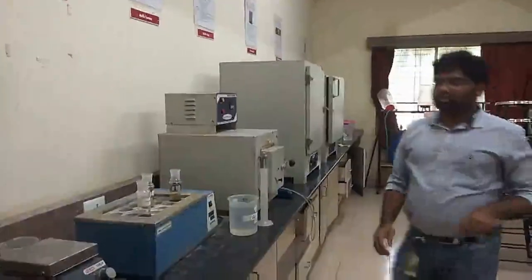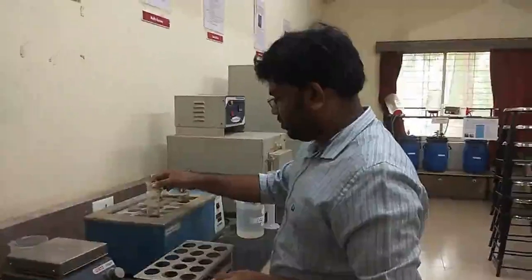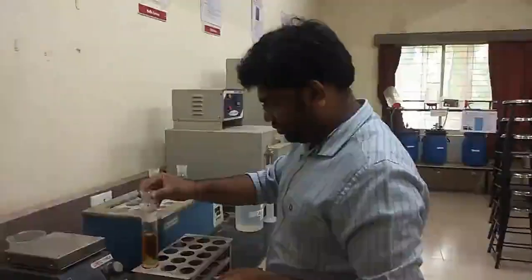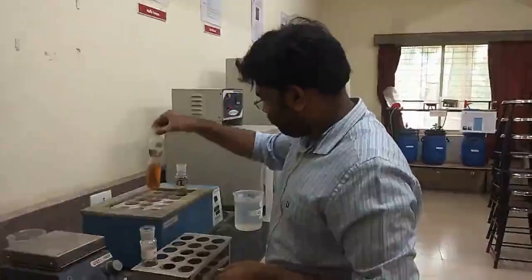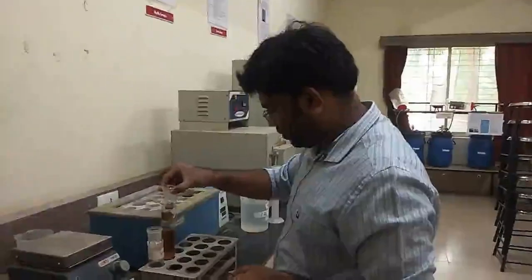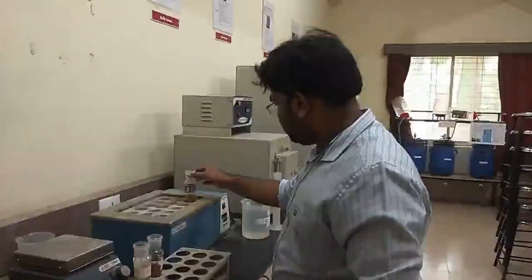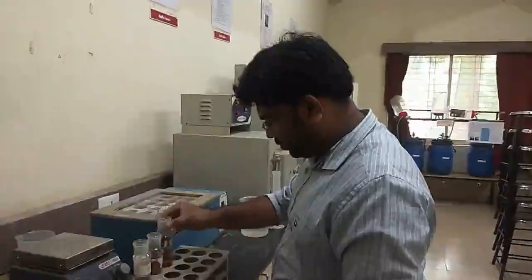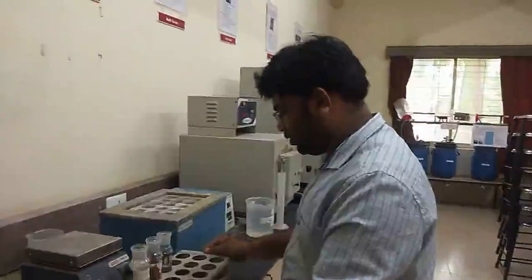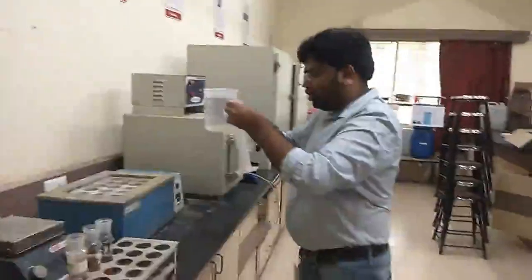After that, a very important step: we are going to remove these COD digestion flasks, and then 70 ml of distilled water is to be added to each of these flasks.